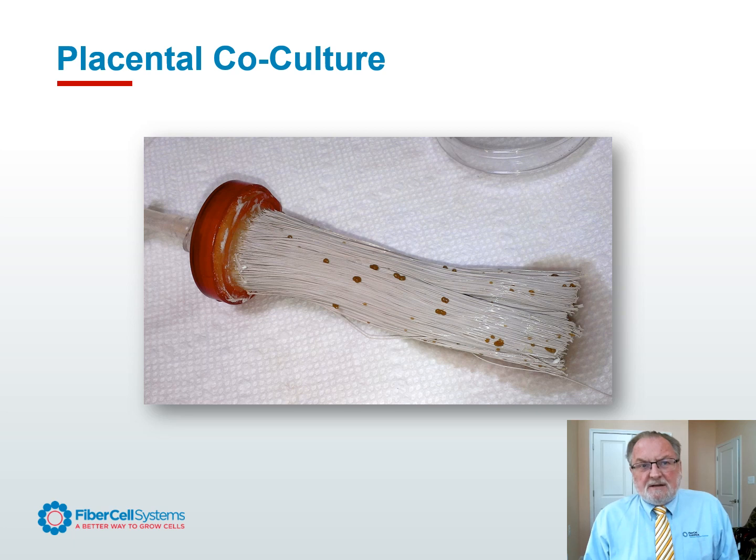7 to 10 days. As you can see, it's a 4-dimensional culture. We had time for these red nodules, 3-dimensional red nodules, to form on the surface of the fiber. And even more interestingly, we got a whole new batch of suspension cells that we could harvest from the cartridge, being secreted by these red nodules. Suspension cells that are de novo being generated inside this hollow fiber bioreactor system.